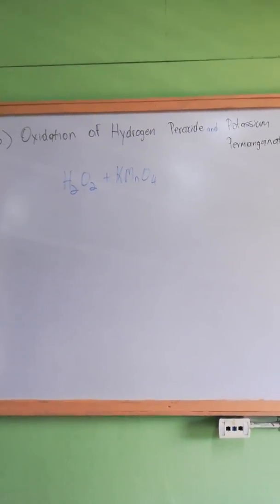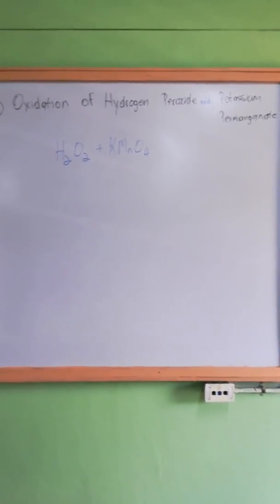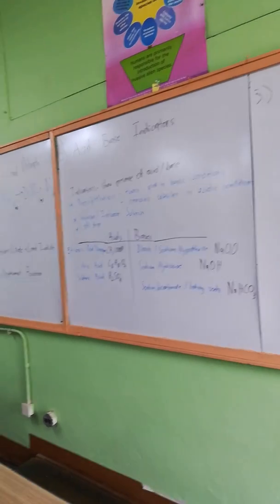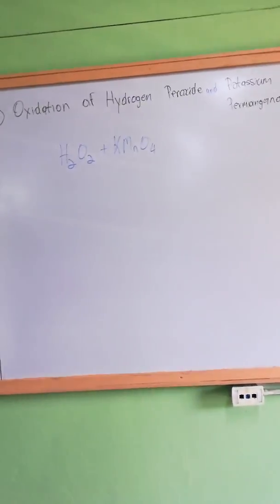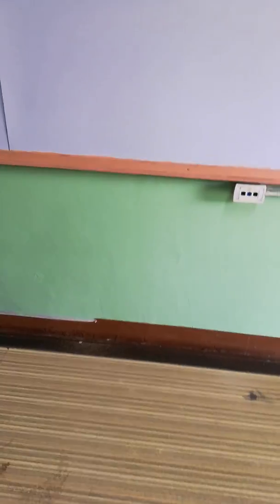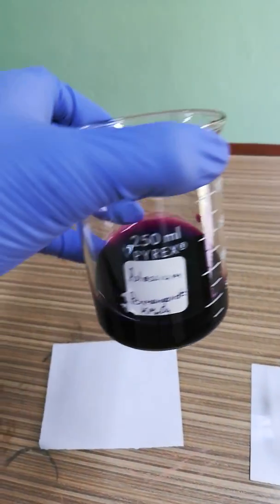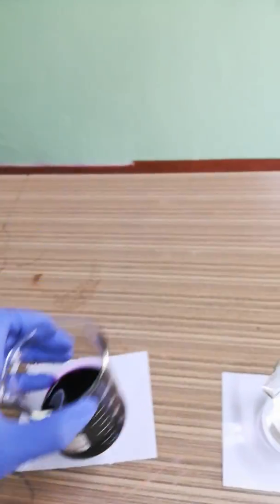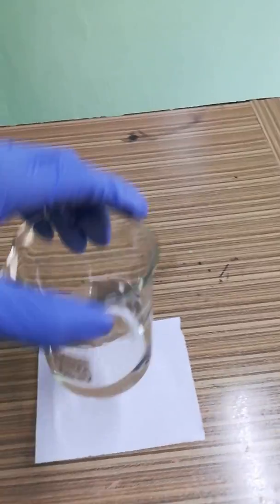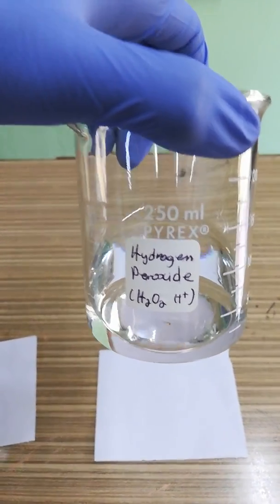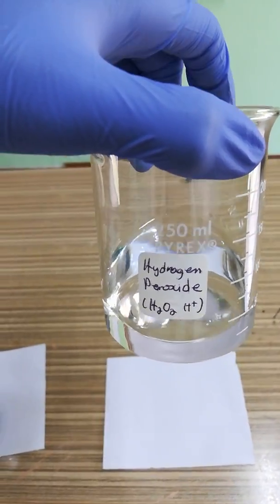The third experiment is the oxidation of hydrogen peroxide and potassium permanganate. I didn't write a formula because it's a bit tricky to explain, so I'll just show you the experiment itself. This purple thing is potassium permanganate KMnO4, and this is hydrogen peroxide that's been acidified with sulfuric acid.